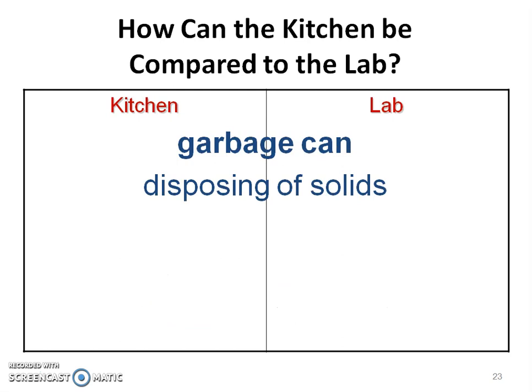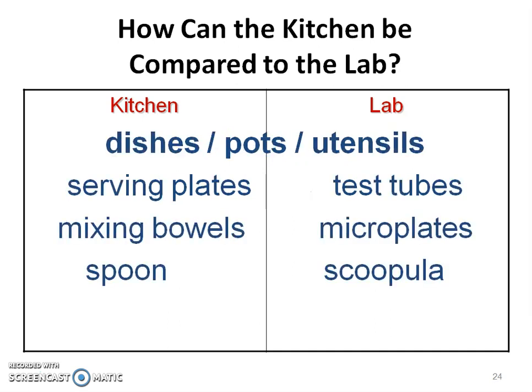Think about the garbage can. In the kitchen you dispose of solids in the garbage can. We do not have a garbage disposal in the lab, so all solids go in the garbage can, not the sink. In the kitchen you use dishes, pots, and utensils; in the lab we'll be using test tubes and scoopulas.